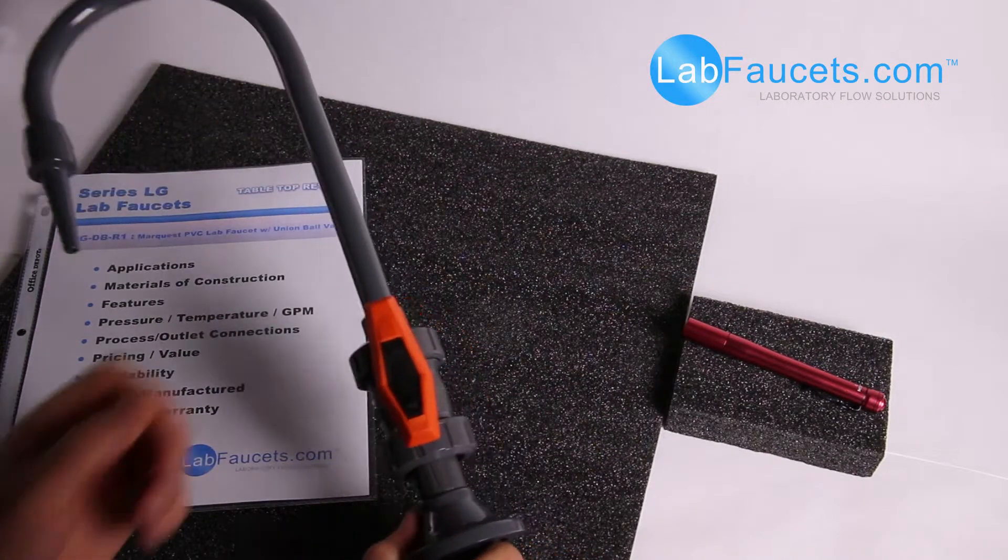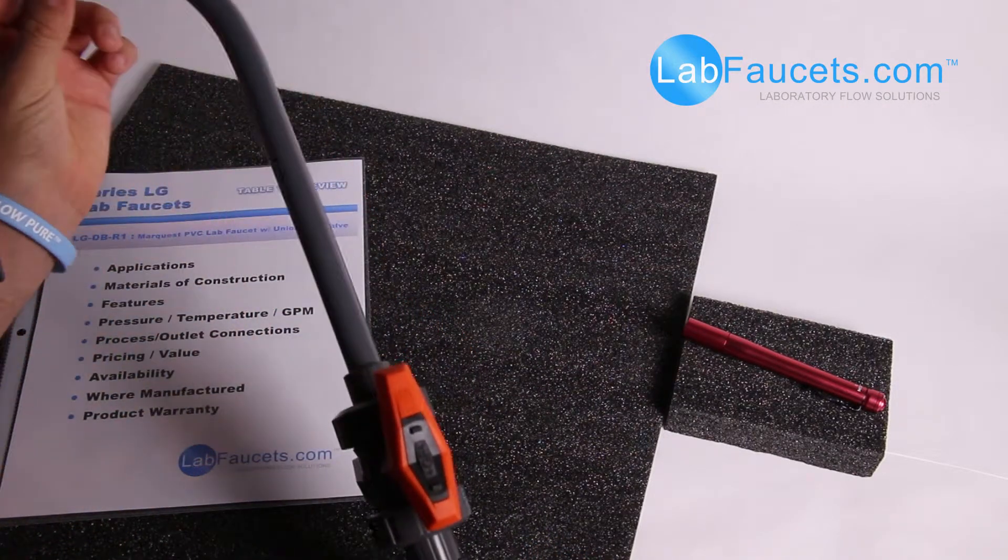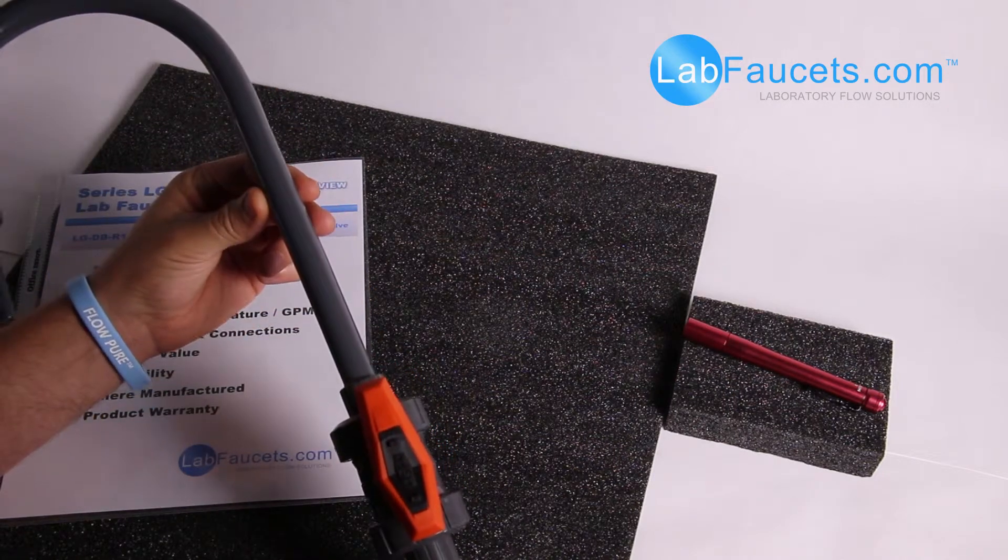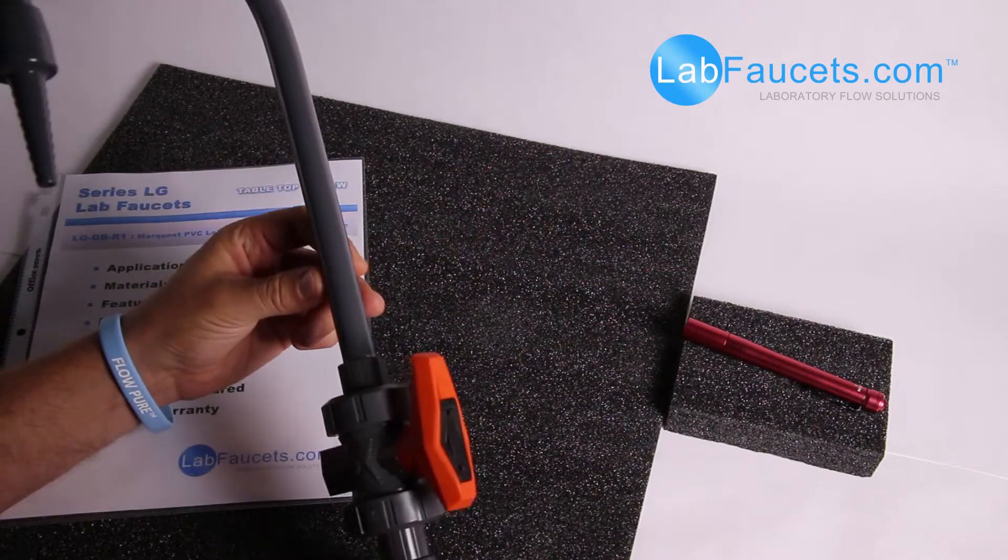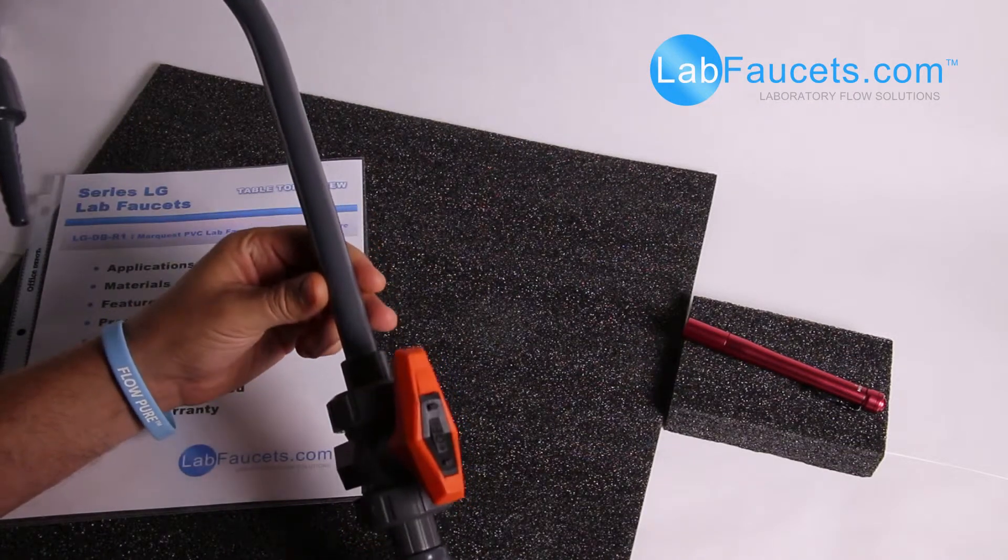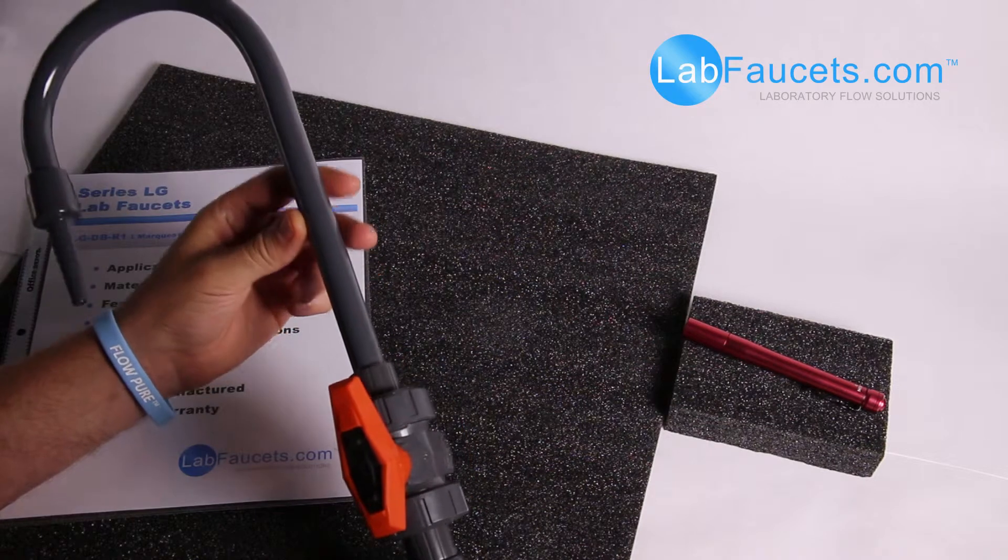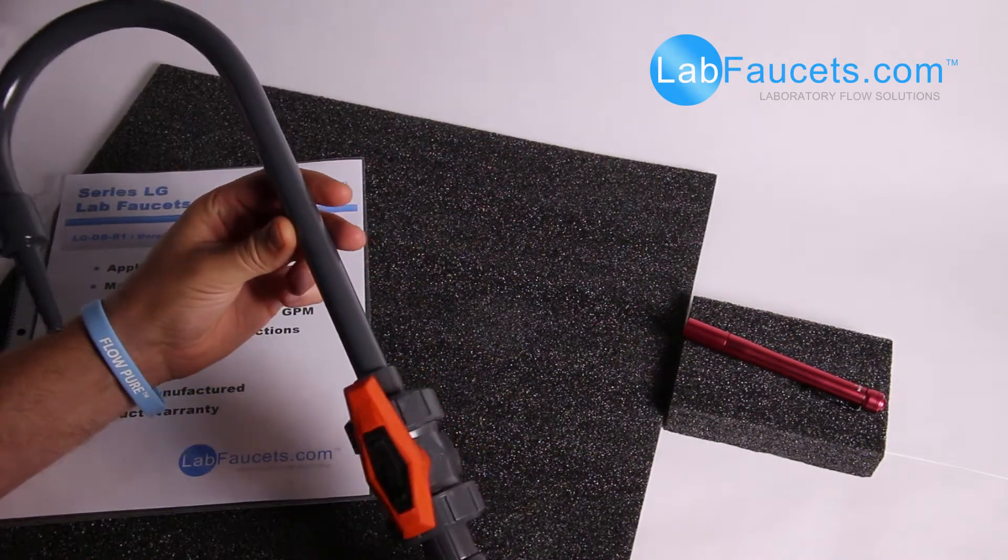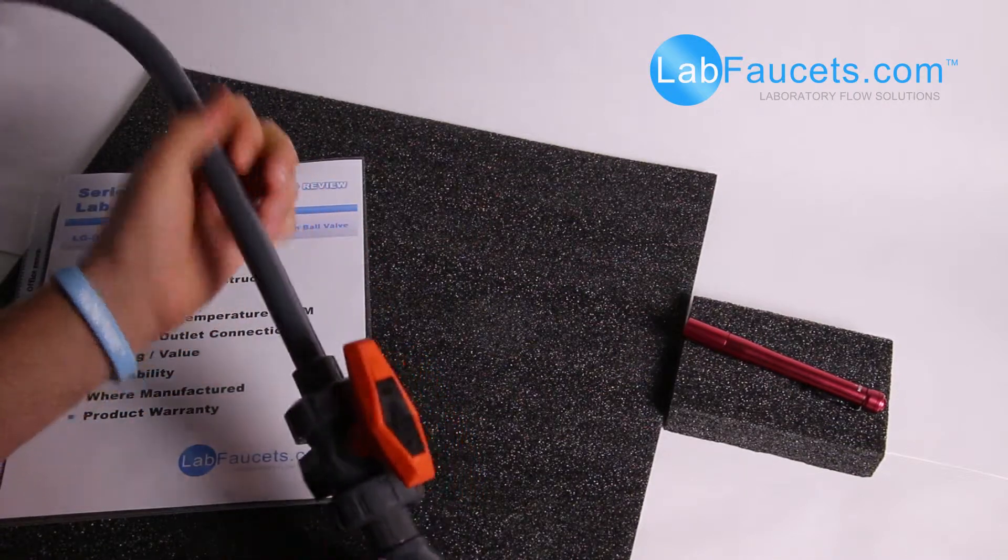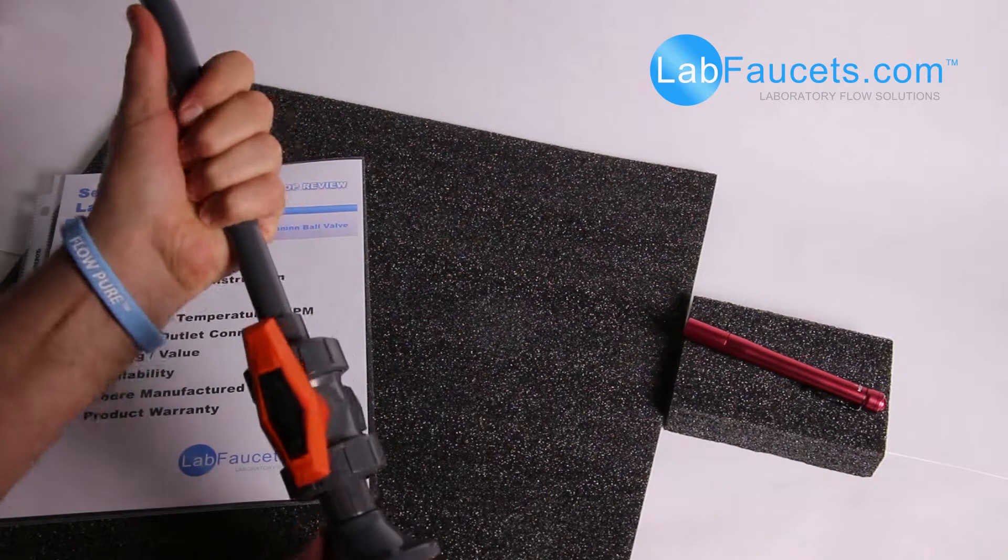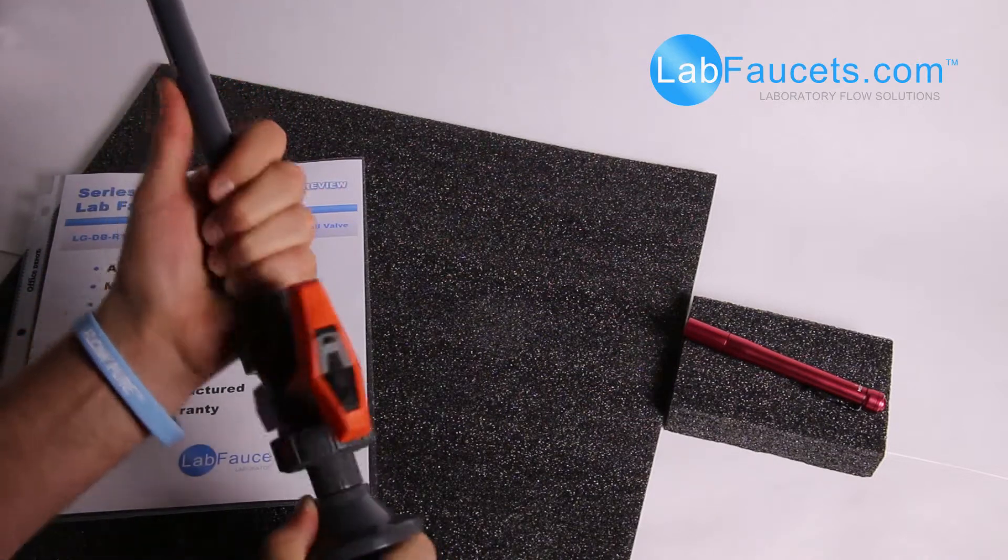The gooseneck, this PVC gooseneck is actually custom extruded, so it is not schedule 80 PVC pipe that you do see on other units in the industry. This being custom extruded, having a heavier wall section is going to add rigidity to the faucet. So this unit is quite rigid, very rugged.